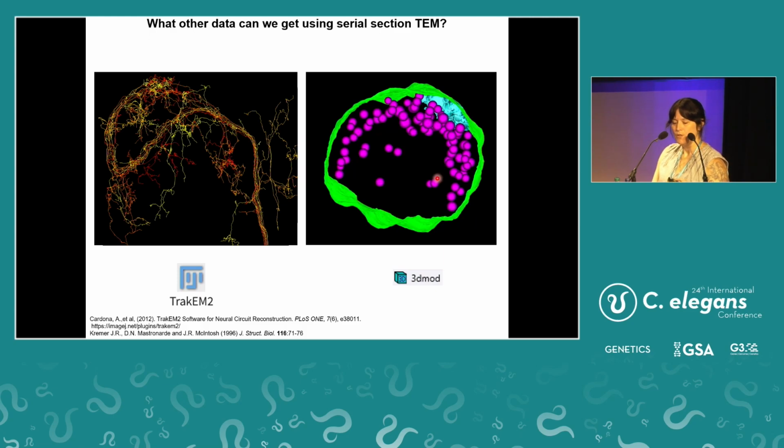This way you can get volumetric information from a single section, because your sections are thicker and you're tilting, you're able to look at a single synaptic profile, but get more data on the volume there.